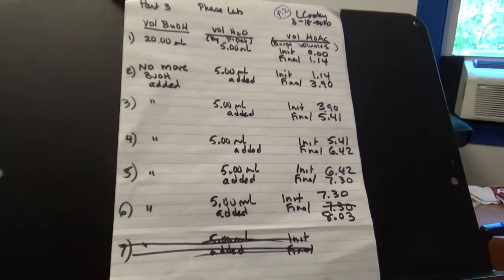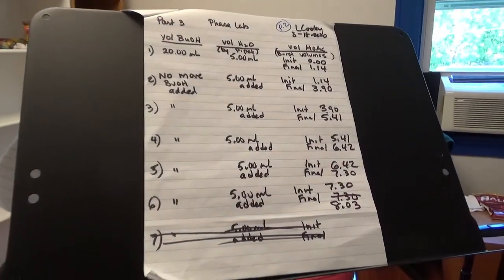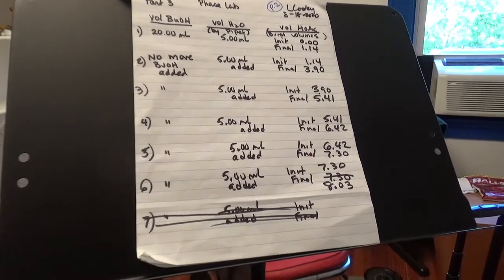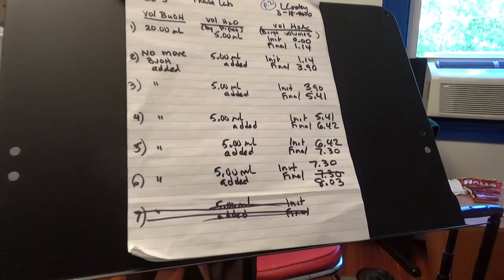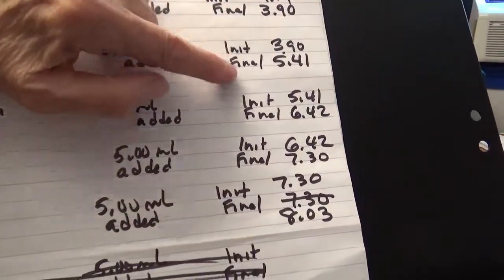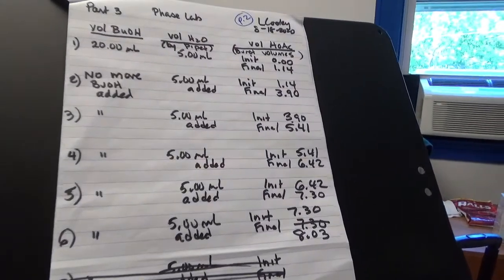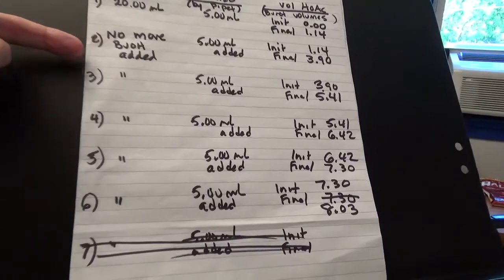And I just want to tell you something else about the lab. When you do this, what you use to figure out the compositions at every point are actually the total volume of each of the components in the mixture at that time. So what you really care about is this final number here at each turbid point, because you want the total amount of acetic acid that's in there, not the amount that was added to go from 2 to 3. You don't want that.